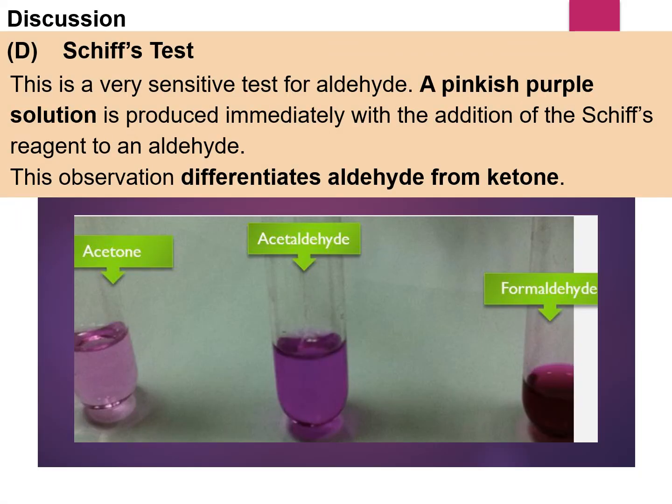For part D, which is Schiff's test, this test is actually a very sensitive test for aldehyde. We can observe a pinkish purple solution is produced immediately with the addition of the Schiff's reagent to an aldehyde. This observation differentiates aldehyde from ketone.